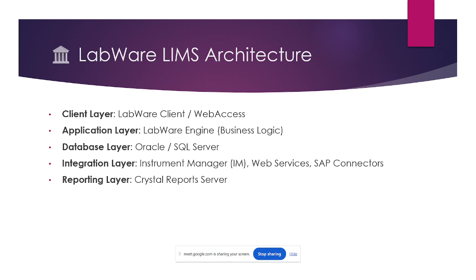And after that, the integration layer. We need to configure some SAP applications, other ERP or MES systems, and BW or Power BI, integrating this LIMS application with other applications. Even lab operation applications, like Empower or LabSolutions, any software, we are integrating with. So whatever integration server you have set up, you need to integrate it with the application layer. Okay, that flowchart I will explain later.